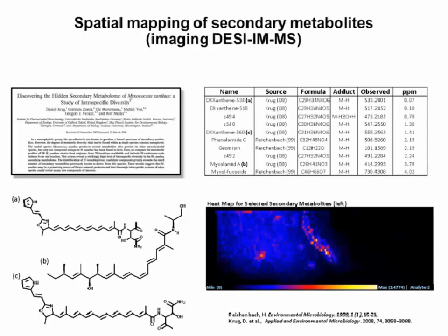To validate our method, we look to other more traditional natural product discovery workflows. In one case, Rolf Mueller and his group, who focus on natural products from myxobacteria, reported close to 67 unique core structures with some 500 different natural product derivatives.